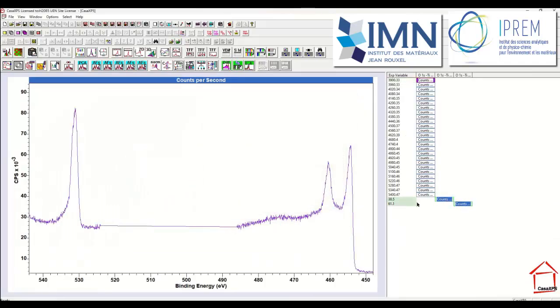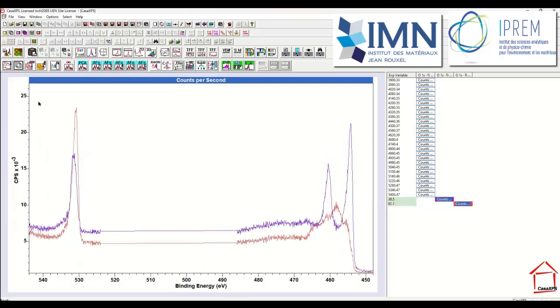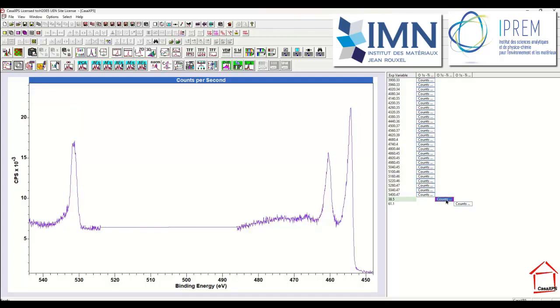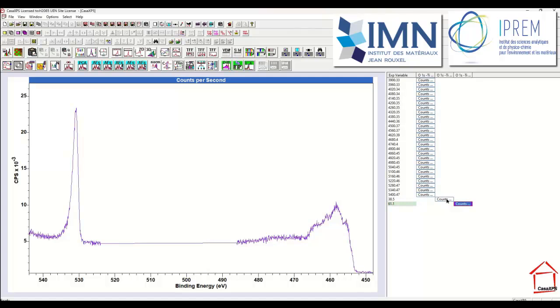So I've now got two component spectra. These are the ones that I've calculated. These are the raw data. I didn't try to take any PCA enhanced data. I just copied without the process data, so this is the raw data. These were already raw data in the sense that no processing was performed on the different spectra.